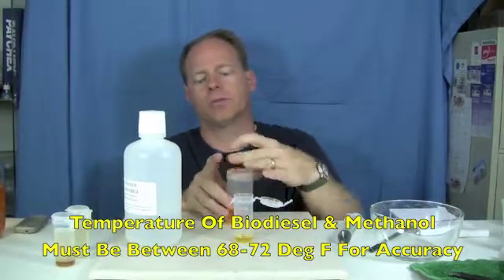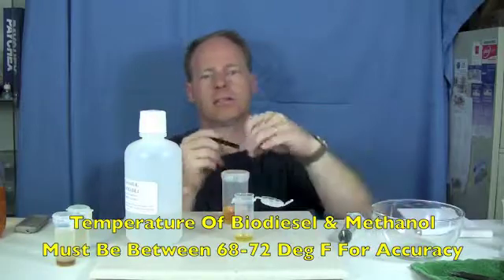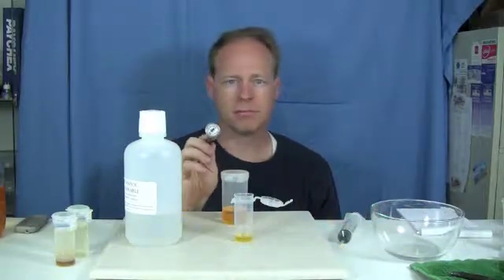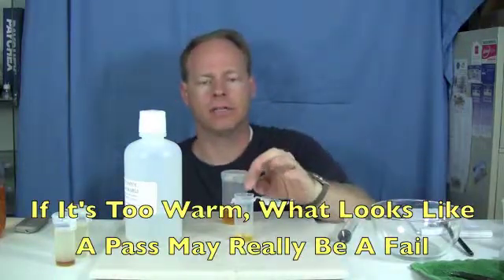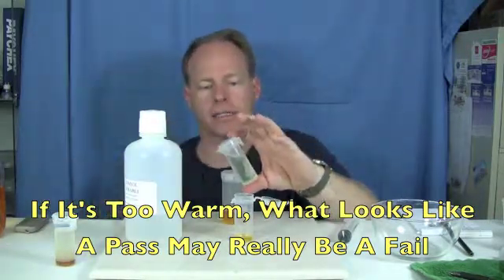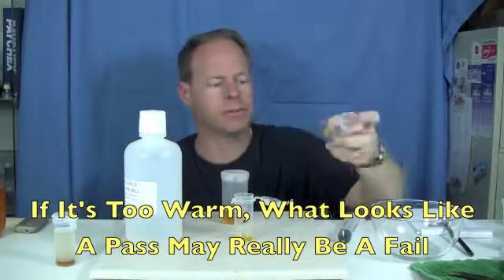I have a temperature-controlled room. I've pre-measured the temperature of this biodiesel using this thermometer and it's about 71, 71½ degrees, so we're right on that limit. If you're warmer than 72 degrees Fahrenheit, it's possible that unreacted biodiesel can dissolve into the methanol and it will make the test look like it passed when in fact it didn't.